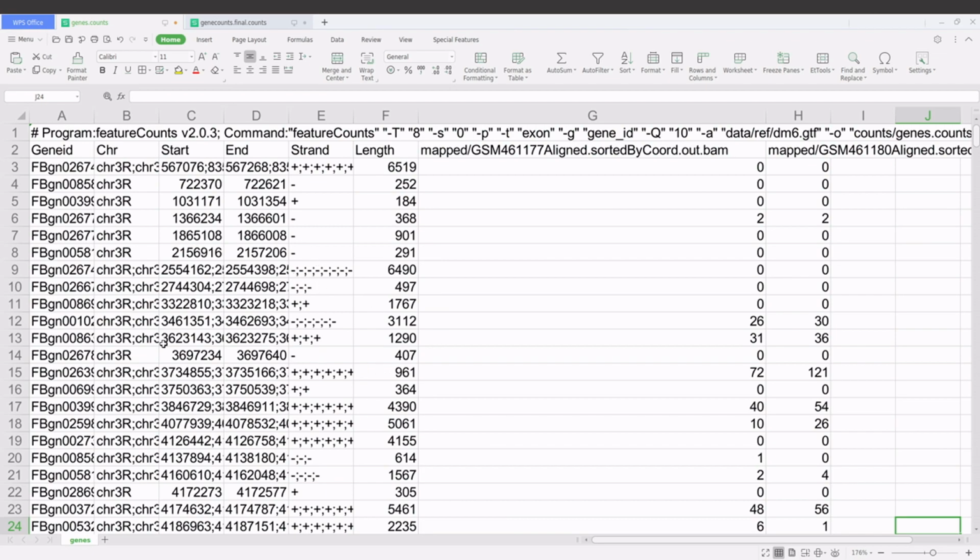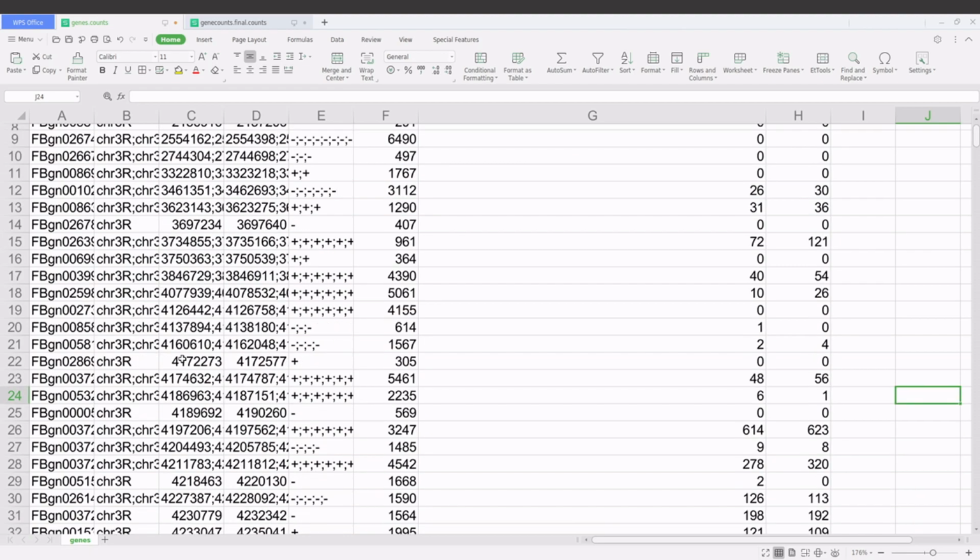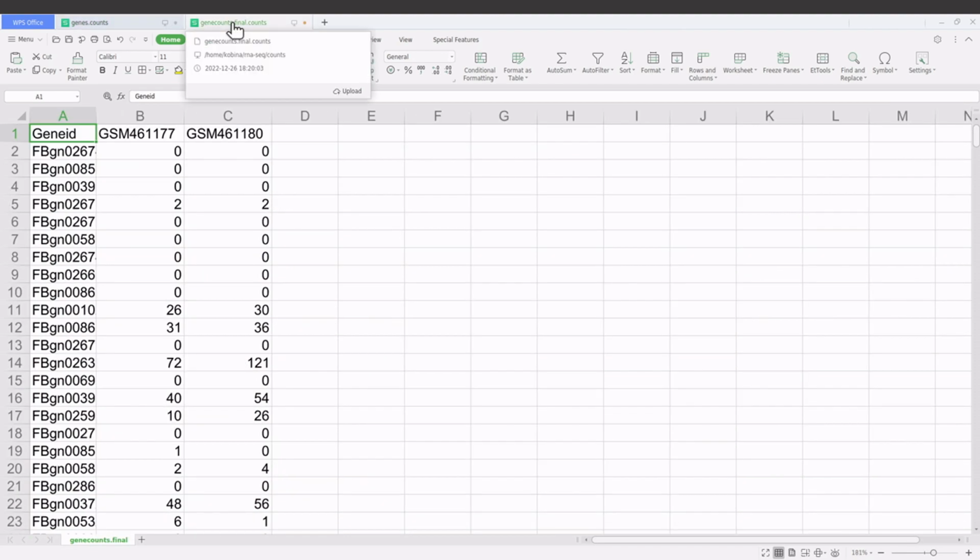Of course, you can also use some of the information here for other analysis, but if you are going to perform gene expression analysis, then the information you need are the genes and their respective read counts, and then the samples that the genes were identified in. So that's what you need to know.